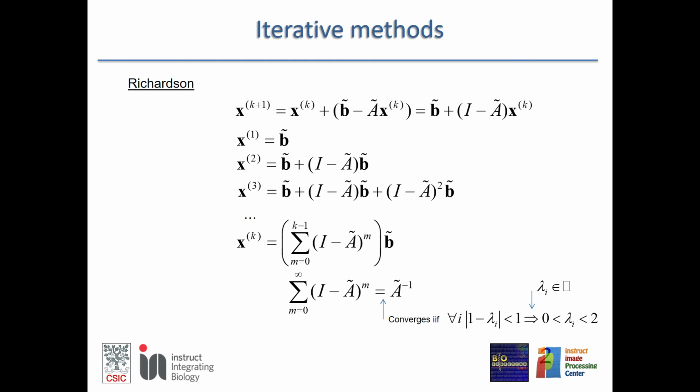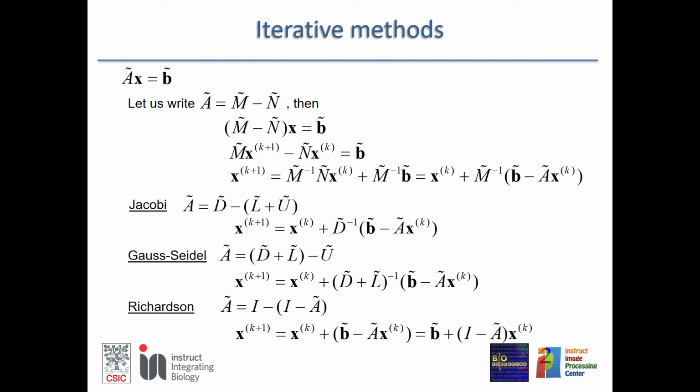Okay, so the iterative reconstructions take a current reconstruction and produce a new estimate of what the object looks like. For doing that, it takes the experimental images and the current reconstruction, makes the projection, computes the difference, and then this difference is placed back in the space of volume.